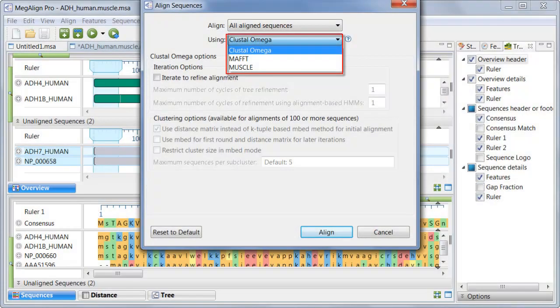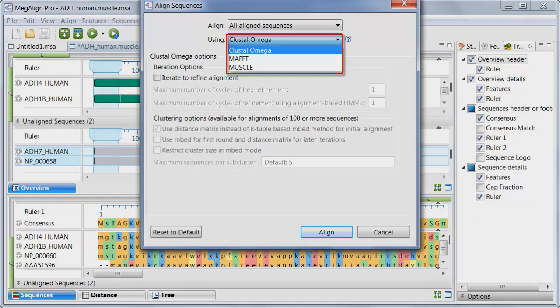In a profile alignment, different methods can be used for each project if desired, and a completely different alignment method used for the merge step.